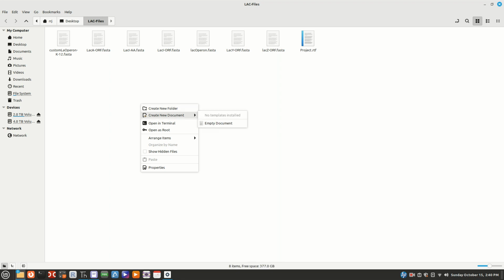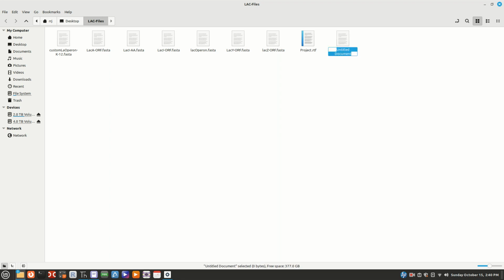Let's create a new document. All right, and I'm just going to call this thing LAC parts.FASTA. All right, and then I'm going to take LAC parts. Where is it?